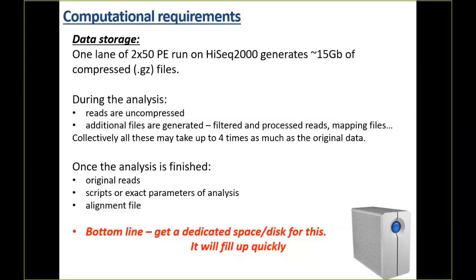But again, there's been a lot of high-profile retractions over the last few years. So more and more journals are requiring that a lot of the raw data be made available. You'll want to keep your alignment file, and typically it'll first come out in SAM format, but then you can generate it into BAM format. I'll go over what those mean at the end of class, and you'll get to see what a SAM format looks like raw. BAM format is by definition not human readable.